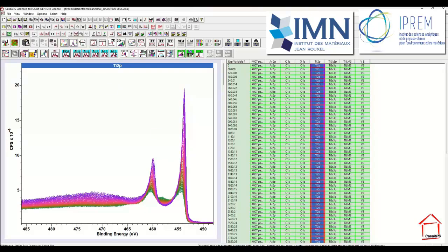The next option, once we've improved the signal to noise in data, is we'll apply the difference operation, which will allow us to take two spectra and then construct a new VAMAS file that contains spectra that represent different proportions of the two selected spectra. And the different proportions will show us shapes that would not be in the data set but might be interesting in terms of interpreting the data.